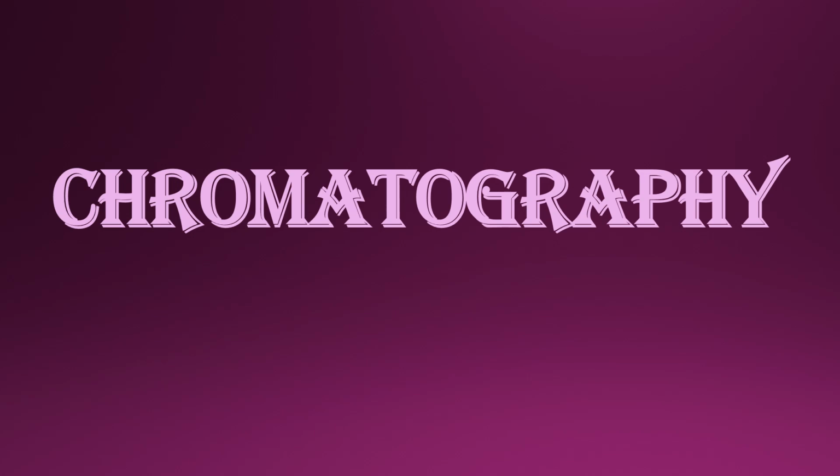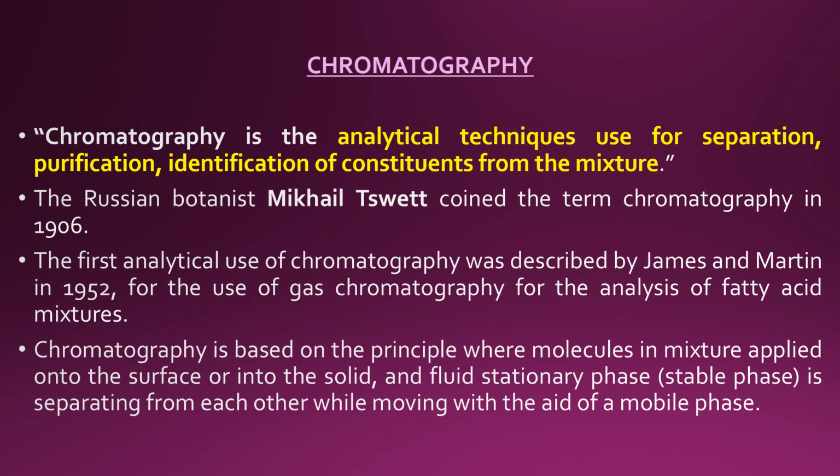Chromatography. Chromatography is the analytical technique used for separation, purification, and identification of constituents from a mixture. The Russian botanist Mikhail Tsvet coined the term chromatography in 1906. The first analytical use of chromatography was described by James and Martin in 1952 for the use of gas chromatography for the analysis of fatty acid mixtures.